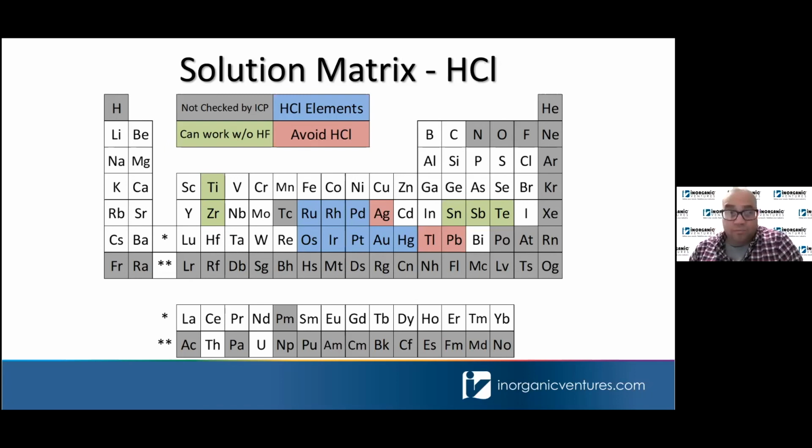For thallium, if your certified reference material producer has access to thallium 3 plus starting material, they can use that, and thallium will be just fine in HCl. But this circles back to the same thing we mentioned about HF, where you have to make sure that ultimately whatever you have in solution is going to be stable, because otherwise you're going to have washout issues if you've got solid literally sitting in your tubes going through your introduction system and into your instrument.